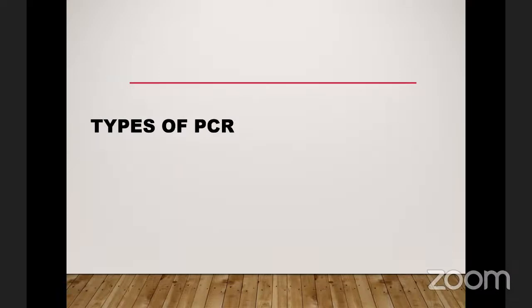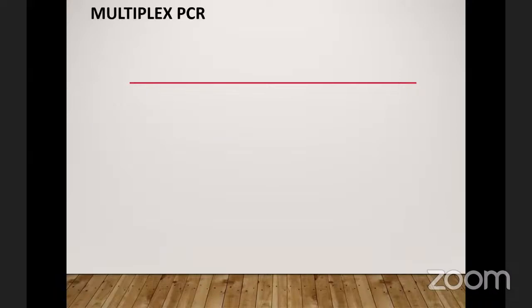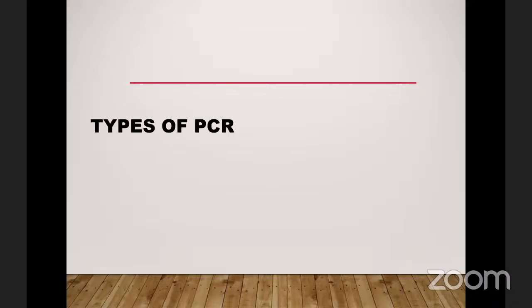Okay, so with what we have done so far, I think we have been able to establish what really happens in PCR, what we do in PCR. We have been able to establish the fact that PCR does targeted amplification of DNA. What I mean by targeted amplification is that we are not interested in the whole stretch of DNA.